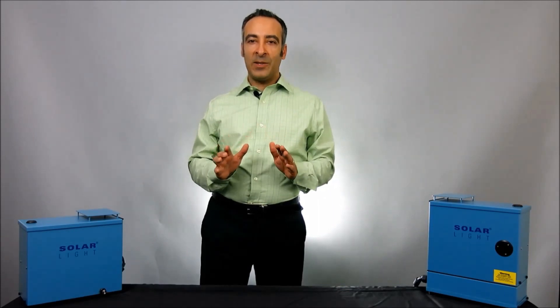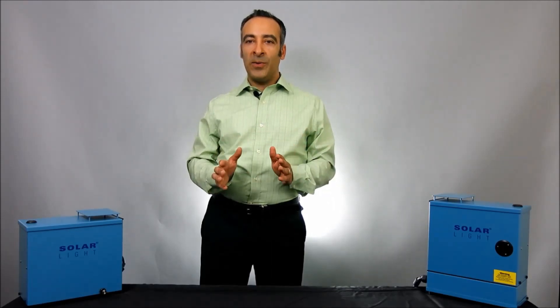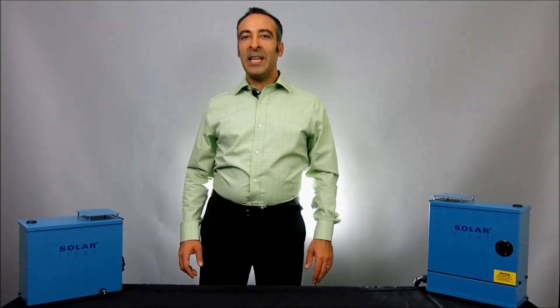We have many, many years of experience in testing hundreds of samples from varied fields including aerospace, automotive, and medical consumables and disposables. Let me walk you through the process of accelerated UV testing here at Solar Light.